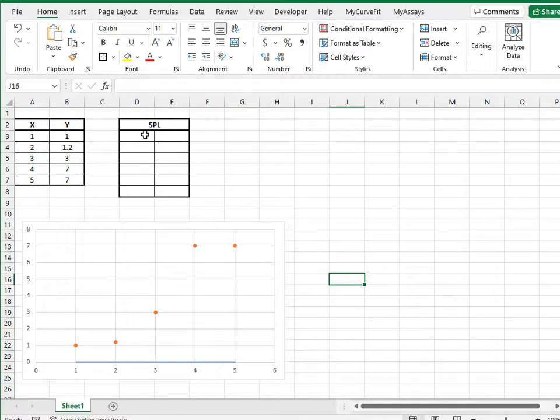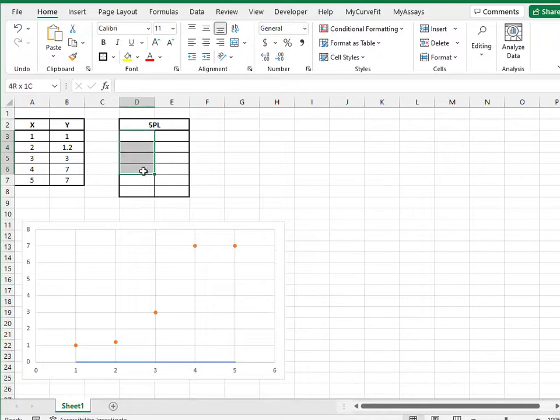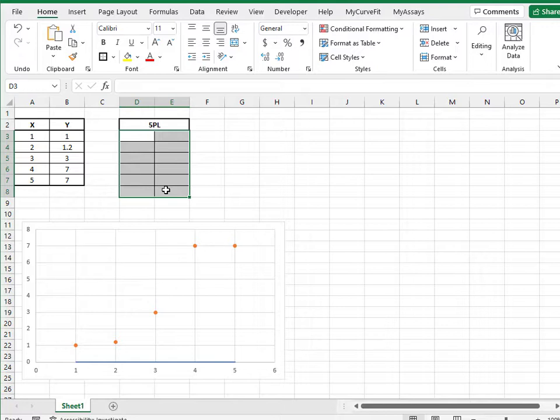For example, when calculating 5PL fit parameters, highlight at least 5 cells, 6 to include the R squared value, and an additional column to include the coefficient names.